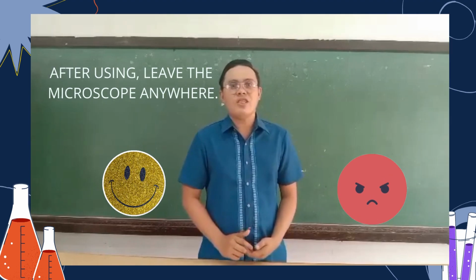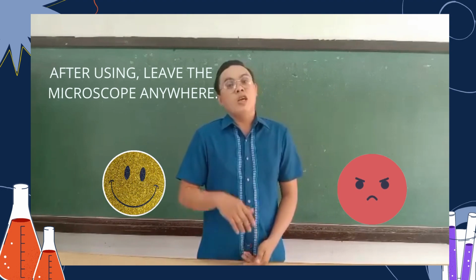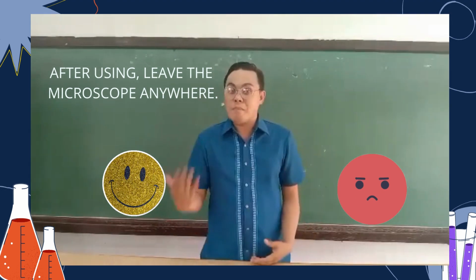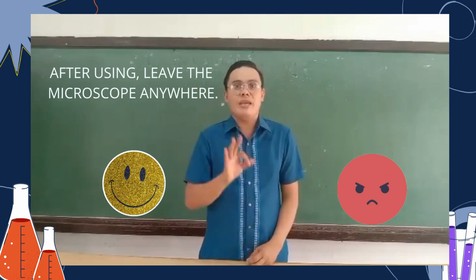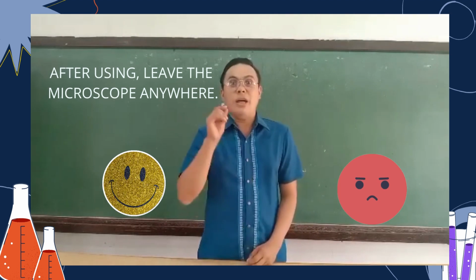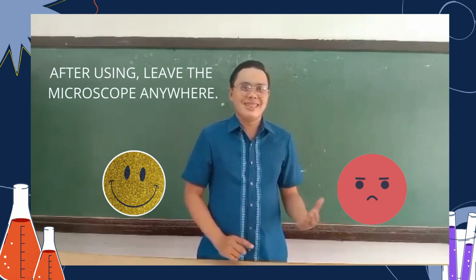Let's have the third question. After using the microscope, leave it anywhere. Is it in a happy or an angry face? In 5, 4, 3, 2, 1. You are correct. It's angry face.